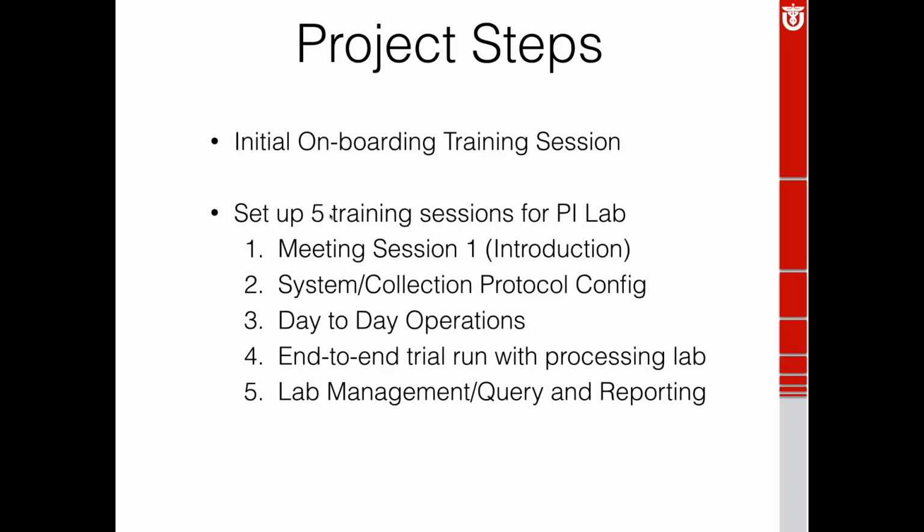So the project steps are essentially what I mentioned, the meeting session. We go through and get their collection protocol configuration done. The next one is a day-to-day operations walkthrough of how things would work with OpenSpecimen. Then we do an end-to-end trial run with the CTRC, because this is all on the premise that they're using the CTRC. And then we work on the last part of it, which is their lab management and query and reporting.